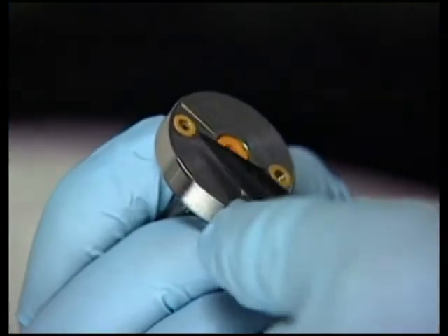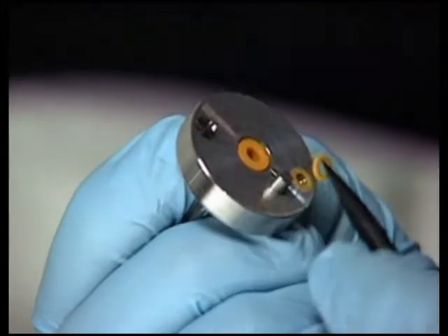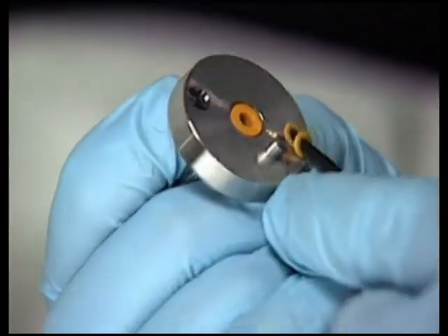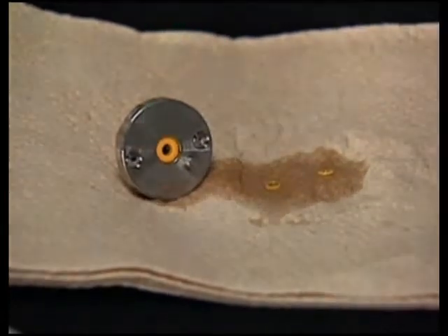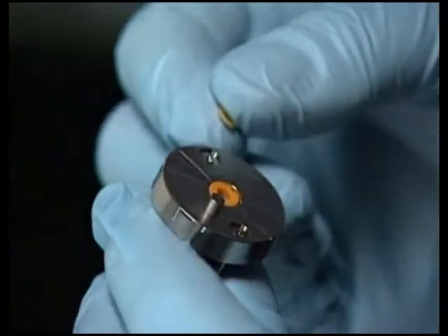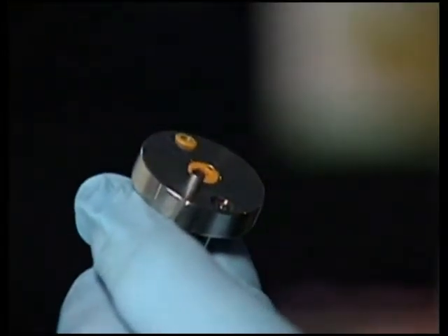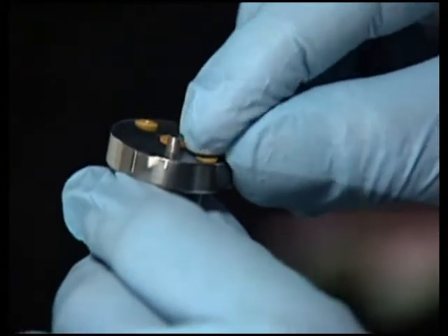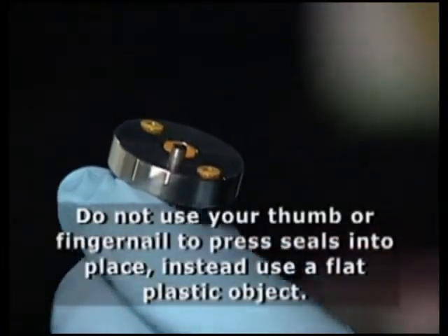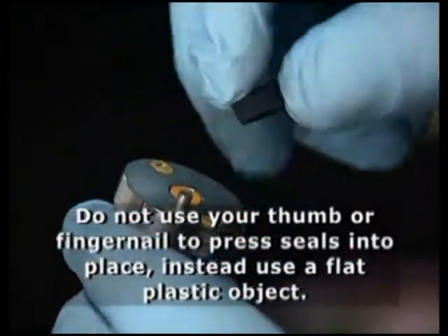Again, being careful not to scratch the surface of the head, use a blunt tool to remove the face seals from the head. Wet the new face seals and the openings in the head thoroughly with methanol. Place the face seals into the openings on the head and press them into place using a flat object that covers the whole area of the seal. Do not use your thumb or fingernail to press the seals into place as they may not sit flush in the head.